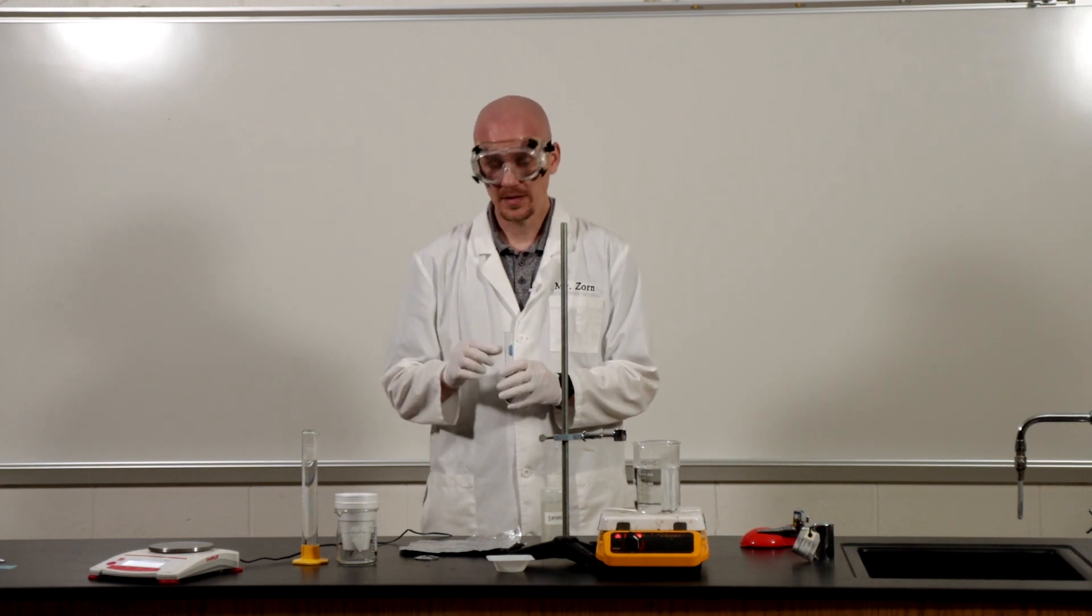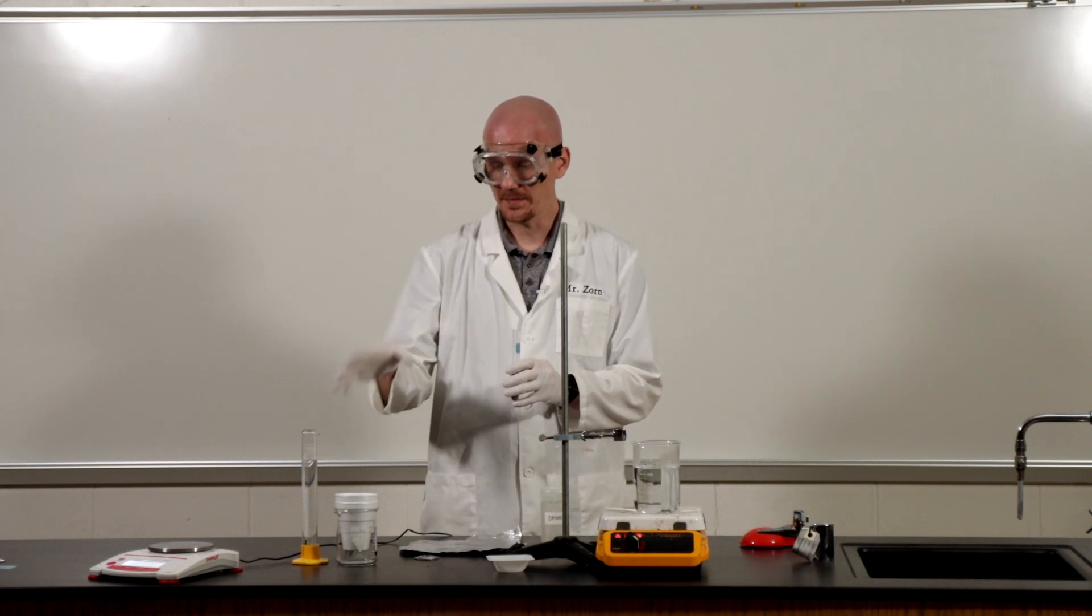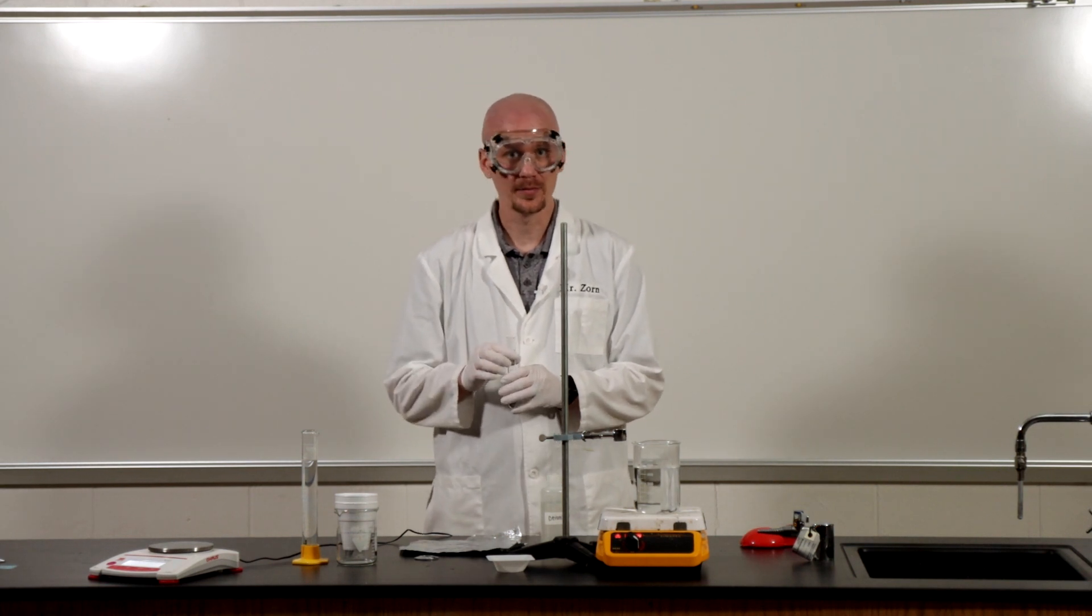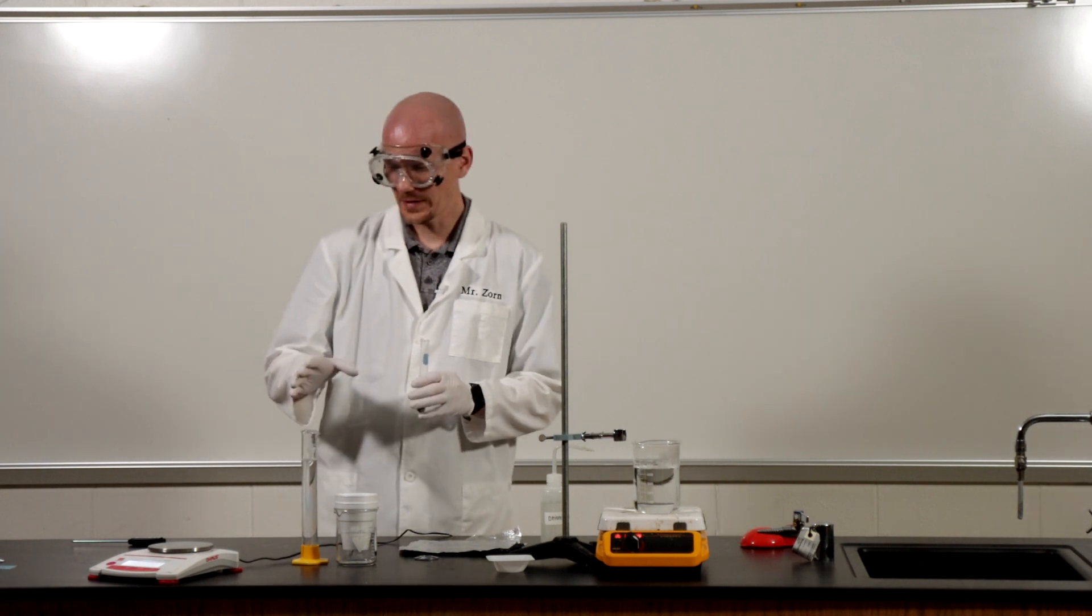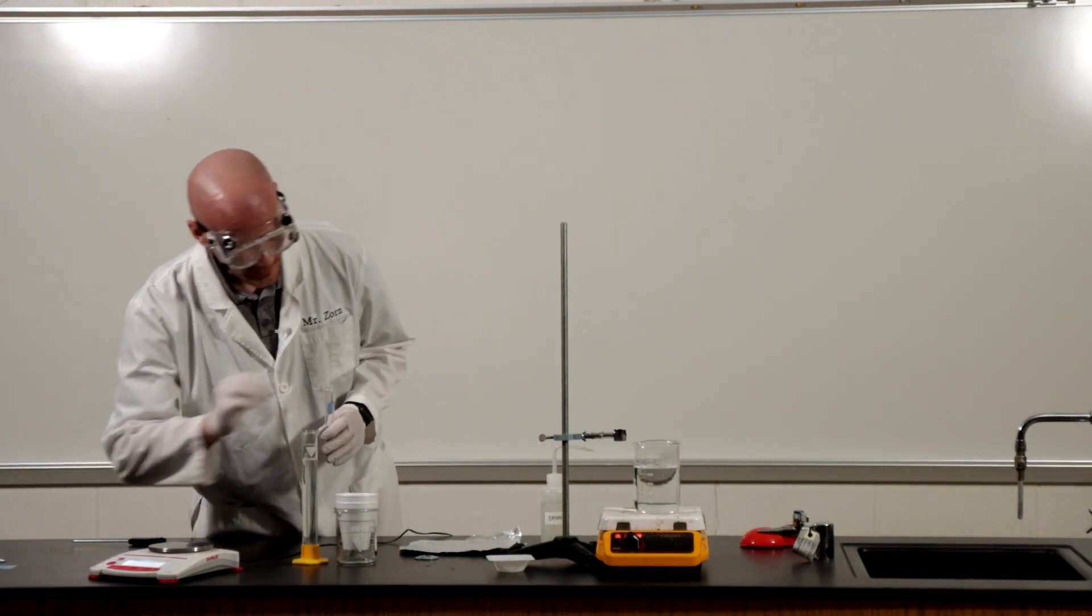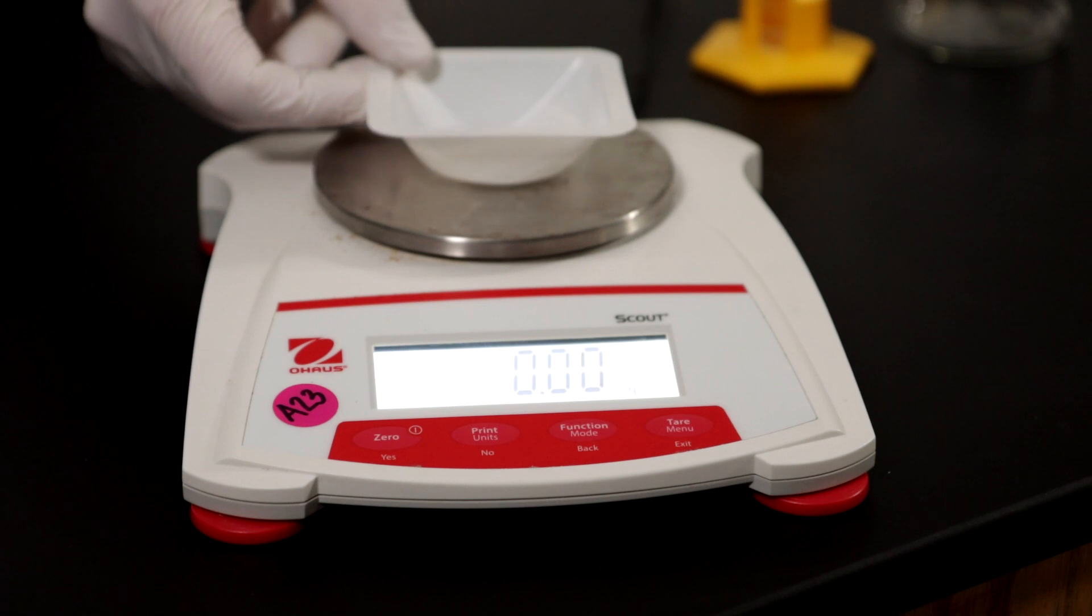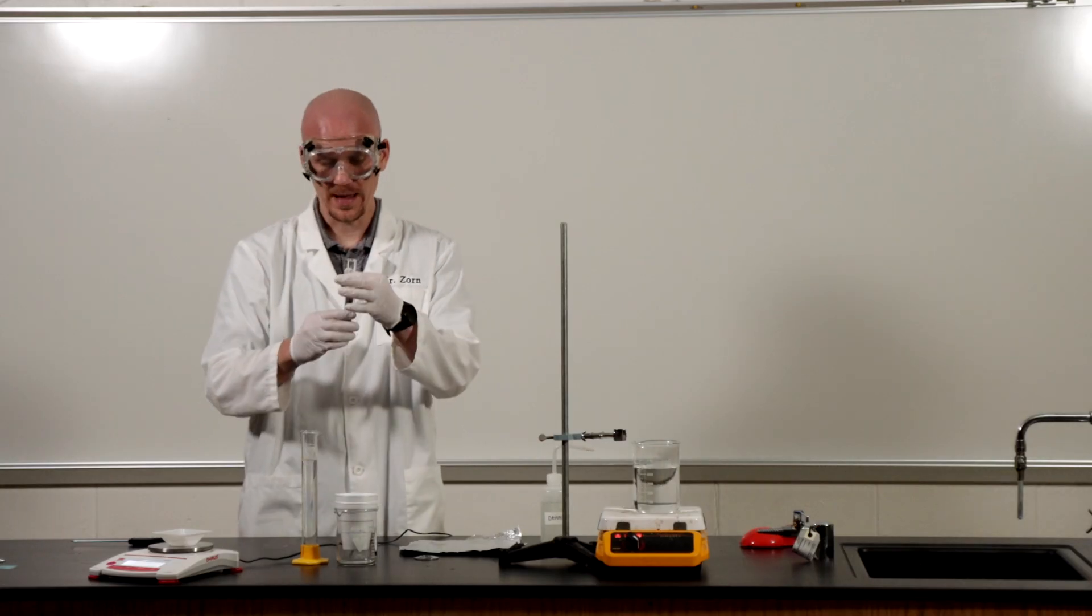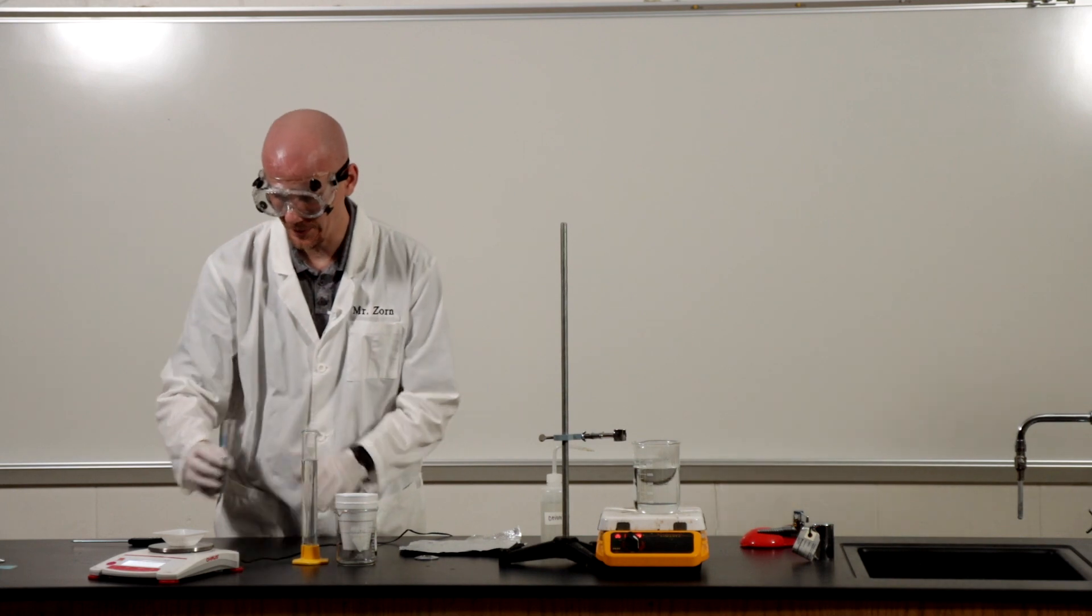So the first thing I'm going to do is I'm going to mass out this sample and then we'll talk about how the calorimeter works. First thing I'm going to do is put my weigh boat on my balance here. I'm going to zero it out and then I'm going to add all of my metal sample to the weigh boat.